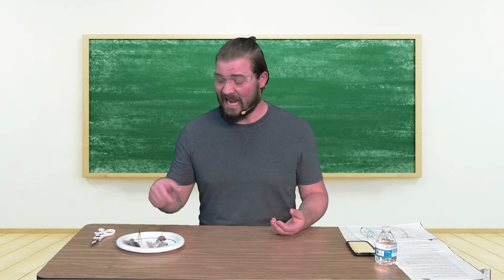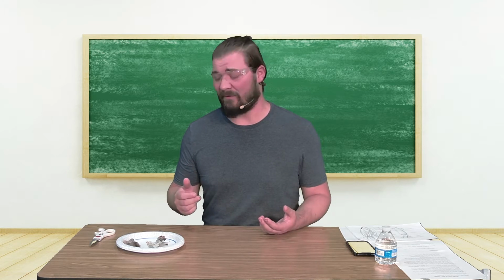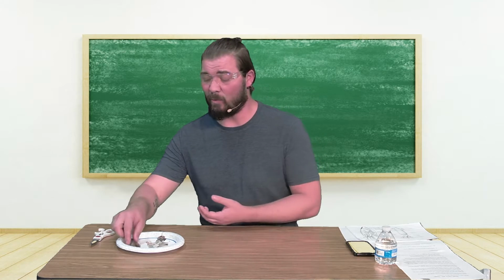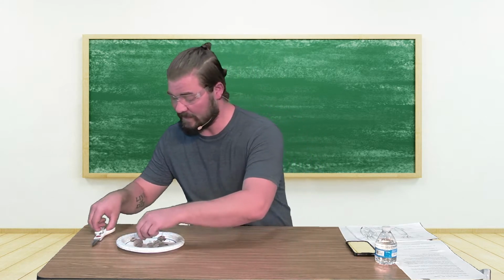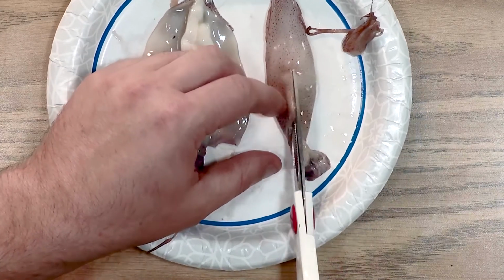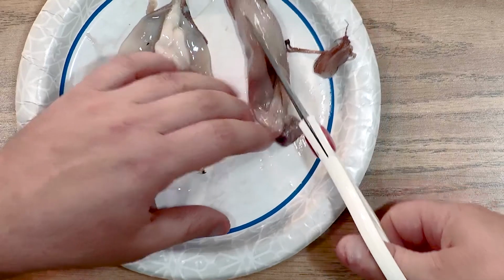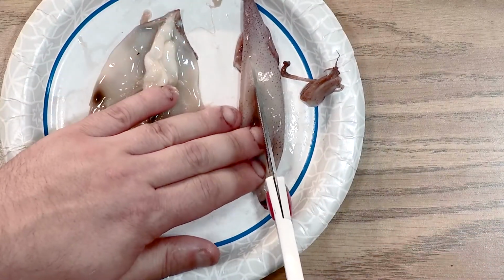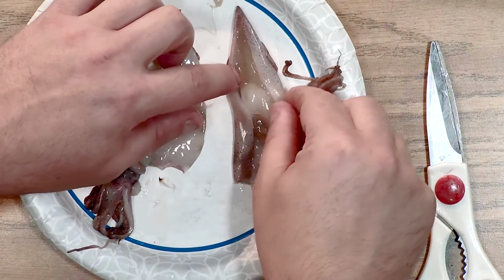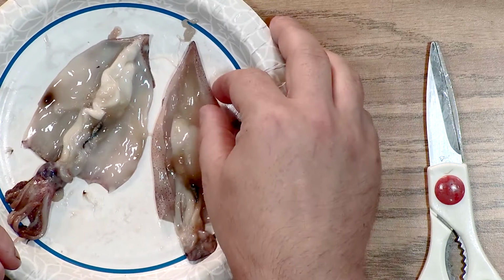All right, so I'm going to dive back in, and I'm really hoping that this second squid we have here gives us a different look inside, maybe one male, one female. So I'm going to, same thing, go to the lighter side, and I'm going to cut into this, really hoping that we see something different. It's slimy. It's sliding around on here. It wants to get away. Yes! Totally different here. All right.